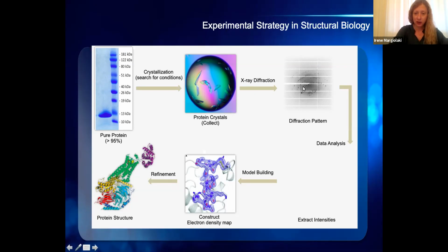After we collect our data based on a single crystal of good quality, we solve the phase problem, and here is where crystallography begins. We need to solve the structure, produce electron density maps, and based on the maps, we refine our structure. Finally, we deposit our model to the Protein Data Bank, where a group of experts runs a set of stereogeometrical software to verify its precision.